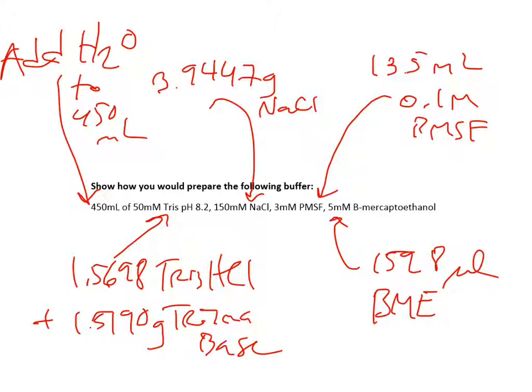So that is how you would make a complex buffer. Again, we're going to do each piece independently, add them all together, and then just add water, and it's a miracle. You end up with a very nice buffer. Hope that helps.